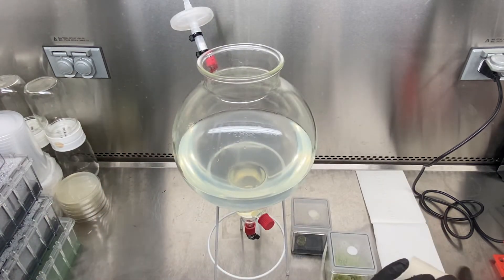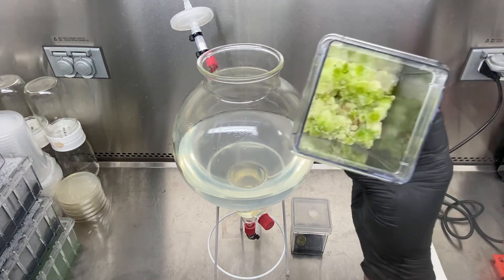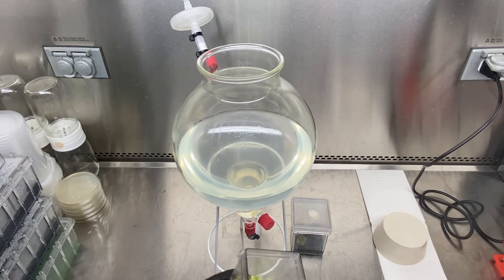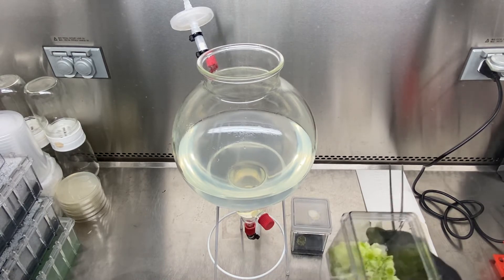Everything inside here is sterile — I'm working in a sterile condition and this drape is sterile as well. You can see it's very green with some differentiation. If you look at my last video you'll actually see how differentiated it was. I'm just going to go ahead and dump it in there.